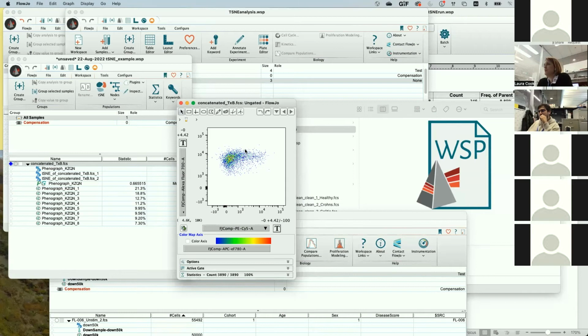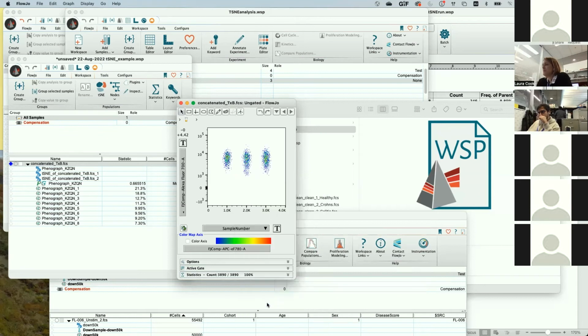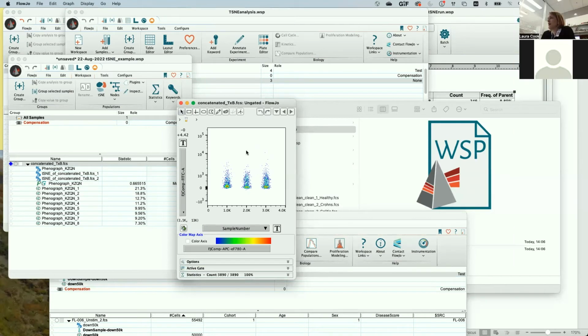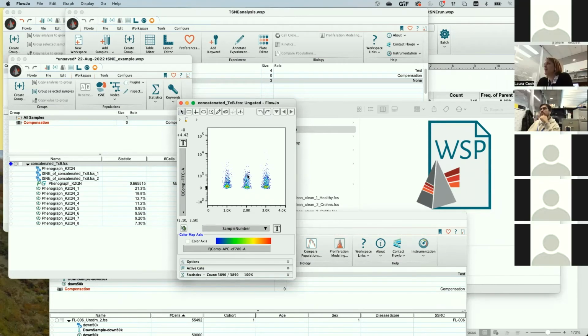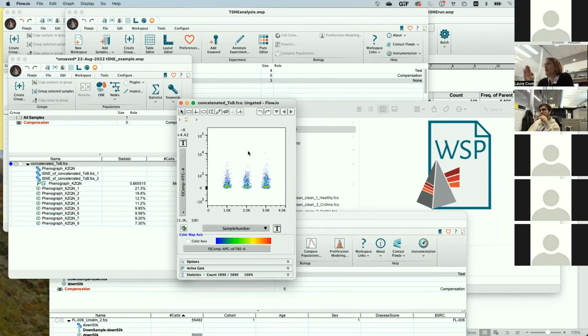So if you've already added your keyword at the very beginning, and number 1 is your baseline or your unstim, and number 2 is your stim, you could quickly have a look here and see, okay, yep, this marker should have gone up, and here it is up here. So basically what the system will be looking at is the spread of those data.